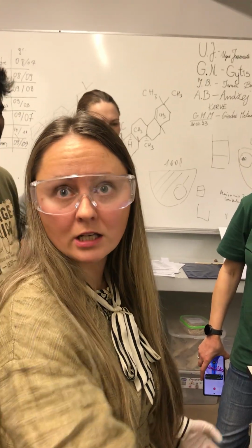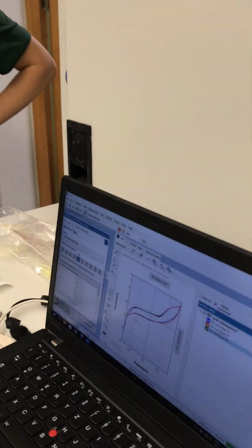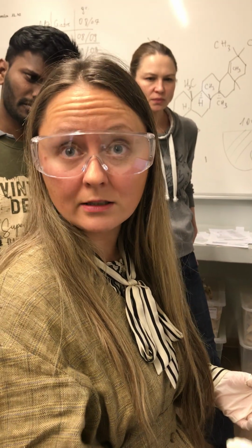Which you can have right here, you don't need bulky equipment. By the way, what is the name of this technology exactly? The name of the technology is called electrochemistry. So there's an electrical process happening and a chemical process. When I was saying oxidation or reduction, that means chemical species are oxidized or reduced.